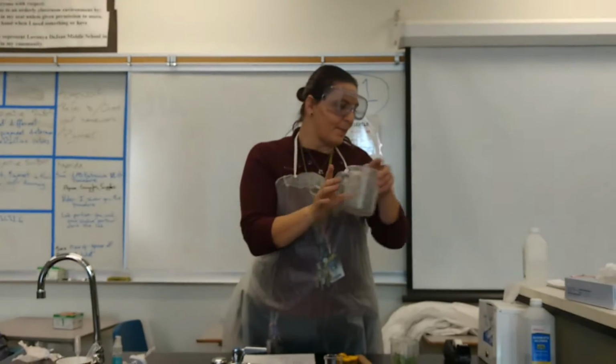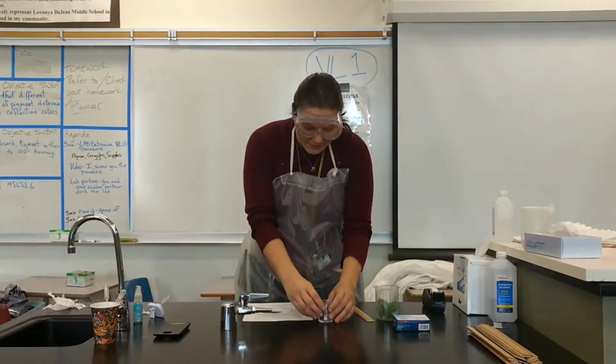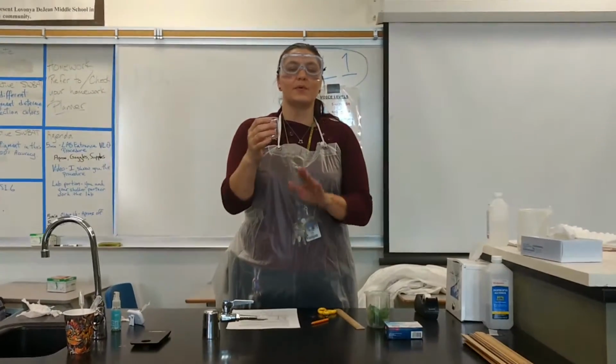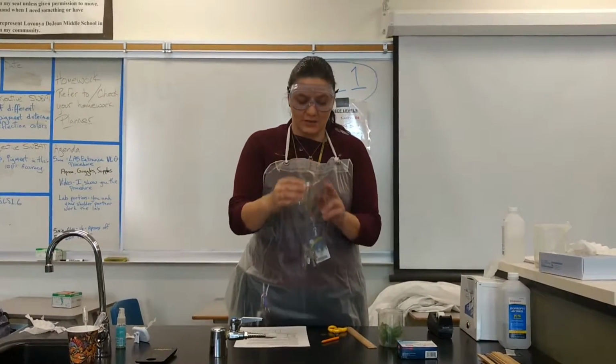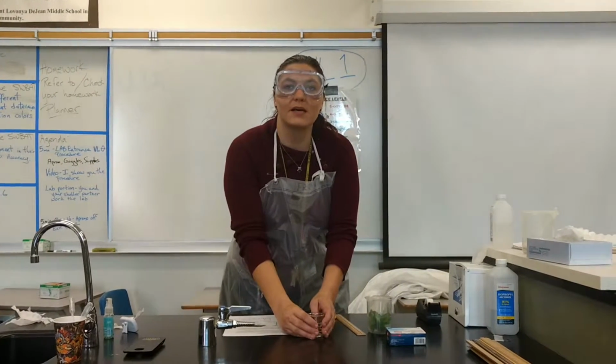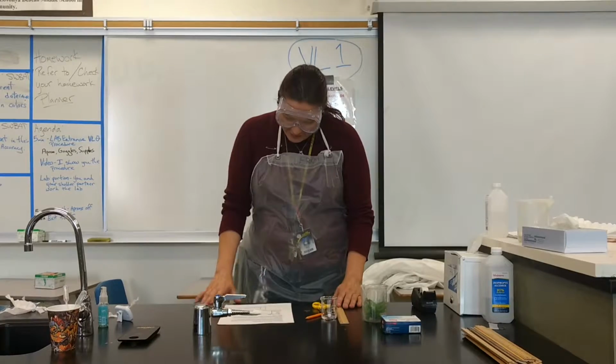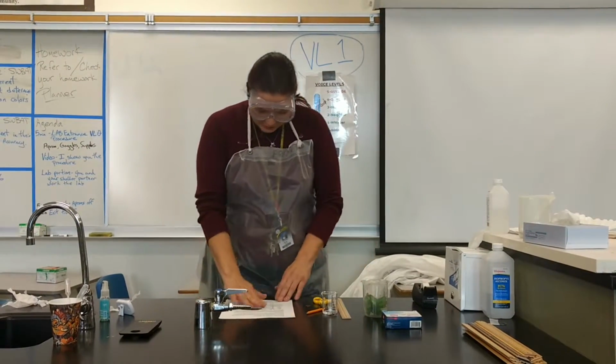Now that I'm done with that, I'm going to take this main, put it back on the teacher table. This is what we're going to use. Now, if we drop this, it's not the end of the world, but we have to be careful because this is glass. So always do your best, both hands on it at all times when you're moving it around. Now, I have everything I need. What I'm going to do is look at my checklist.